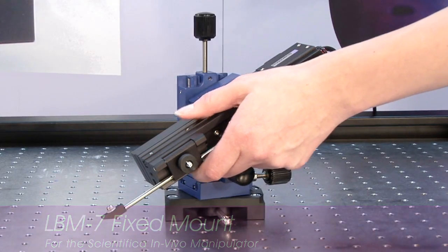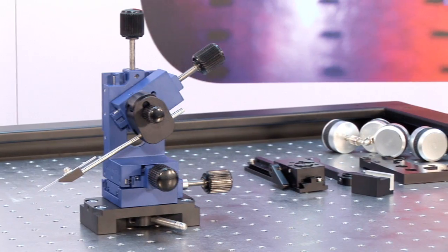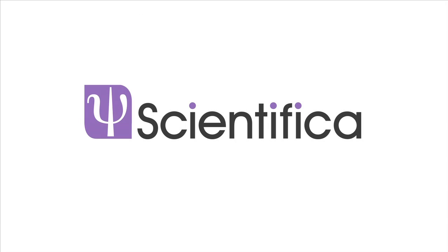The LBM7 is a highly precise and durable manipulator, ideal for positioning of stimulating electrodes and perfusion manifolds. Its reliable manual movement is also suitable for oocyte recordings.